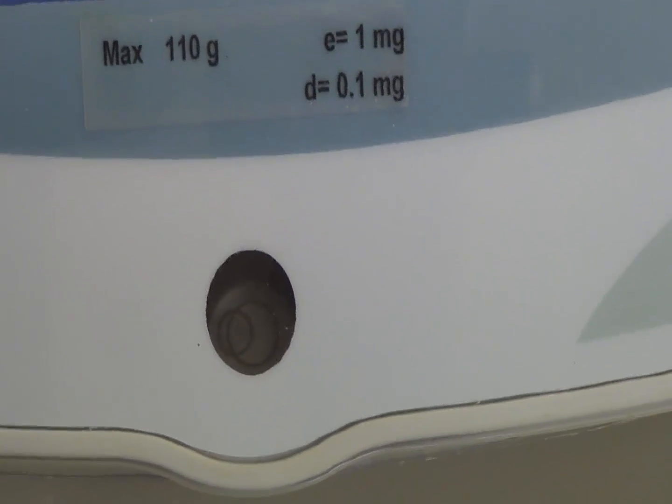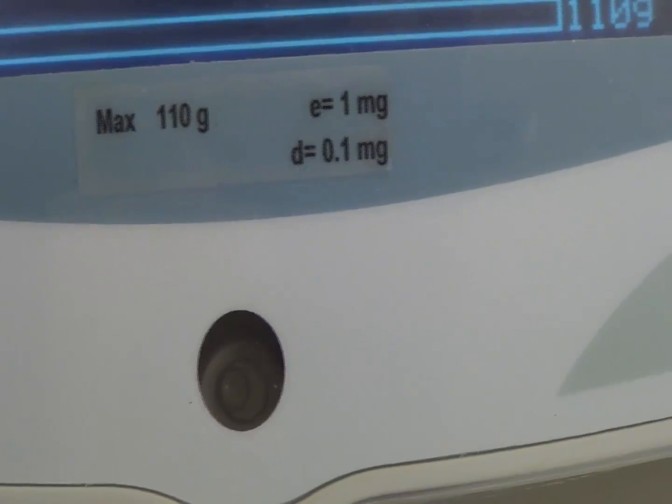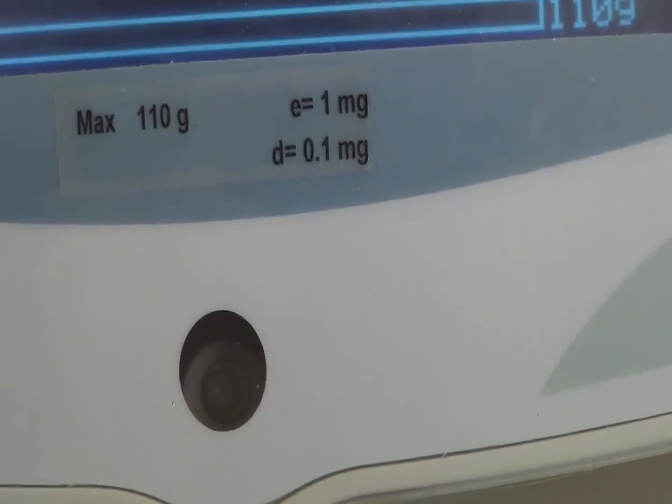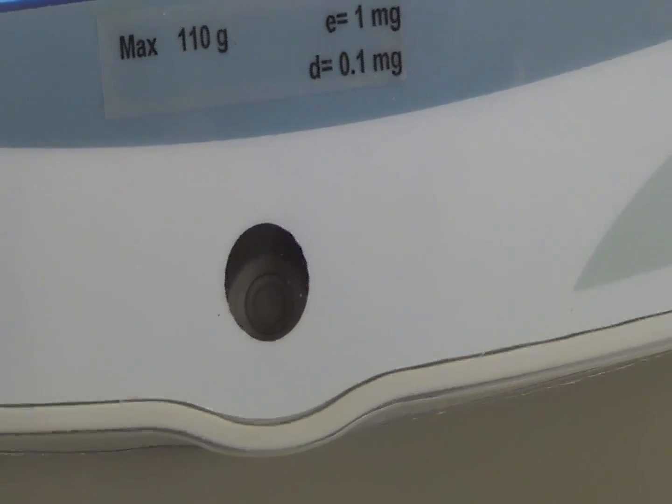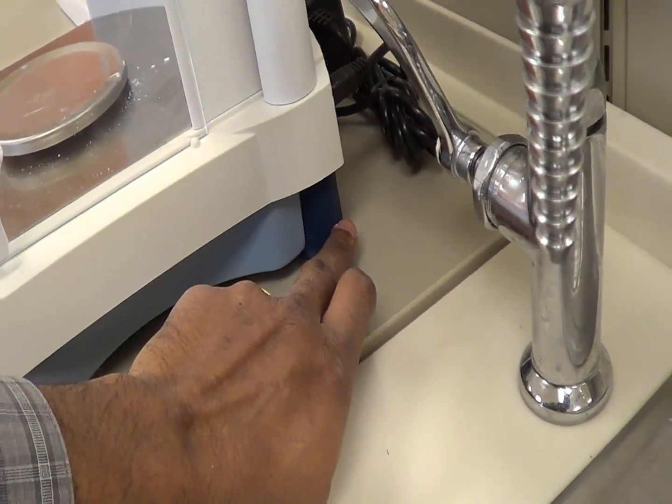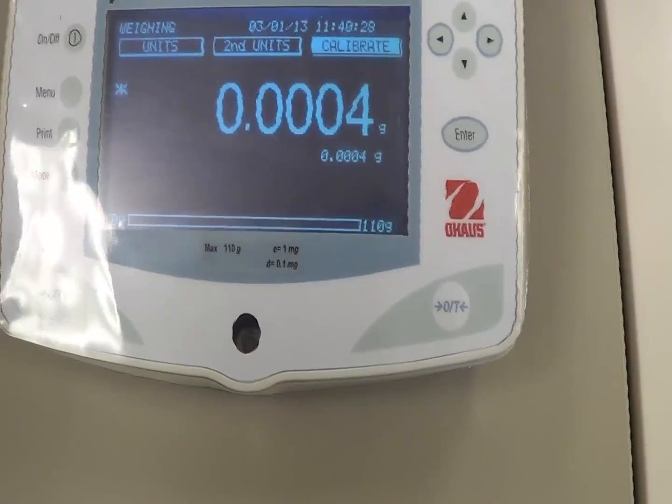So when you want to use the weighing balance, make sure you adjust the base properly by rotating these wheels, either clockwise or anticlockwise. Make sure that the bubble should be in the middle. There are two places you have to adjust: one on this rear end and the other one on the left rear end. Then you are going to use it.